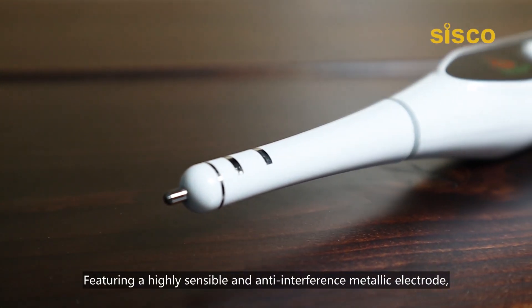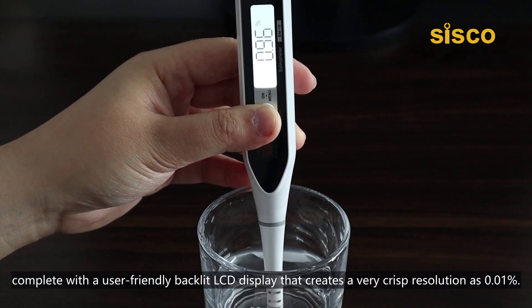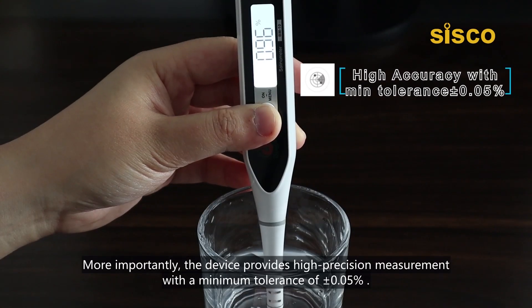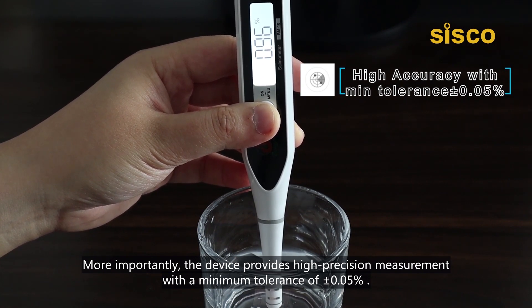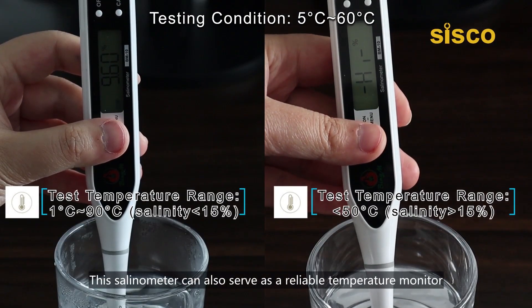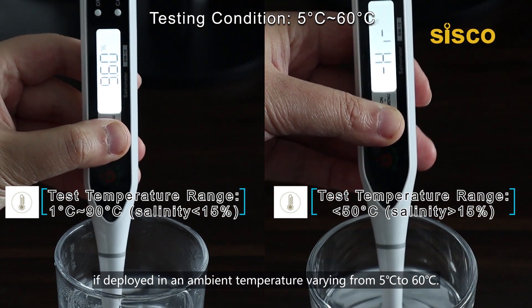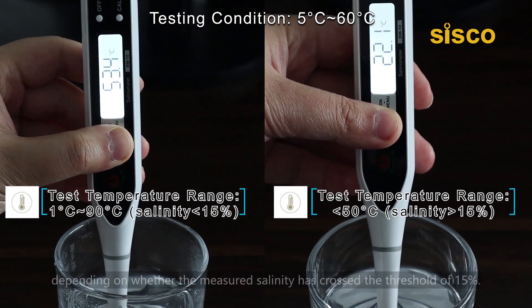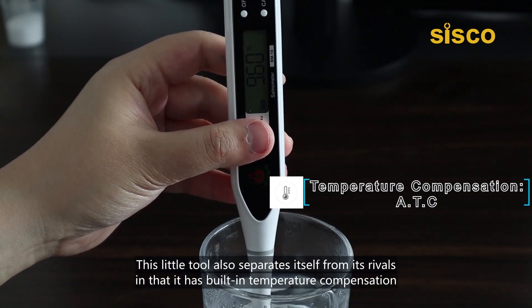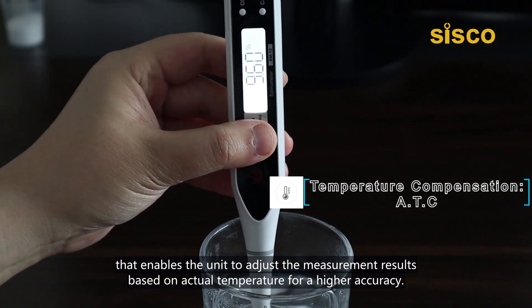Featuring a highly sensitive and anti-interference metallic electrode, this meter is designed to produce a more reliable measurement within seconds. Complete with a user-friendly backlit LCD display that creates a very crisp resolution at 0.01%. More importantly, the device provides a high-precision measurement with a minimum tolerance of ±0.05%, so its accuracy would not be of concern. This salinometer can also serve as a reliable temperature monitor if deployed in an ambient temperature varying from 5°C to 60°C. The available temperature measurement range changes depending on whether the measured salinity has crossed the threshold of 15%. This tool also separates itself from its rivals in that it has built-in temperature compensation that enables the unit to adjust measurement results based on actual temperature for higher accuracy.